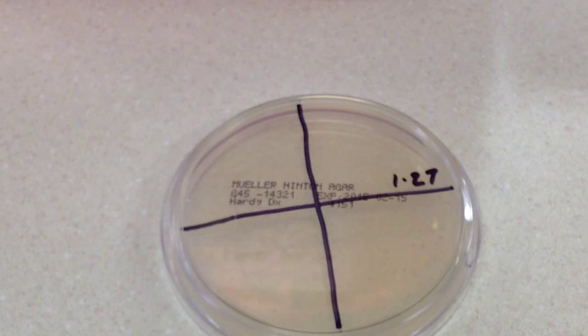making a lawn for Optichin, Novobiocin, and Bacitracin because there we're looking for sensitivity or resistance. Whereas here we're looking for growth. So we don't have to worry so much about making a light lawn.